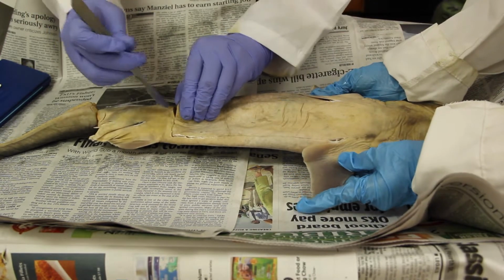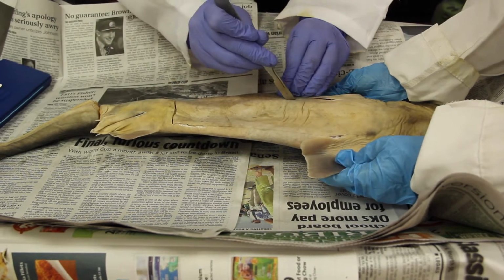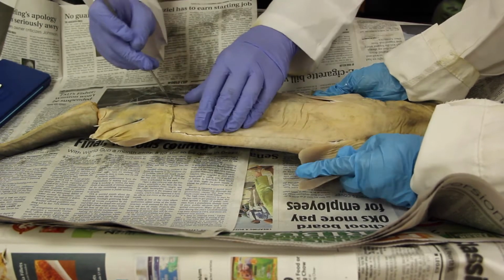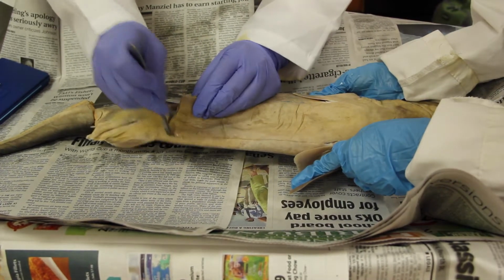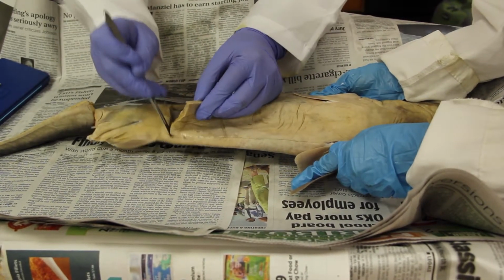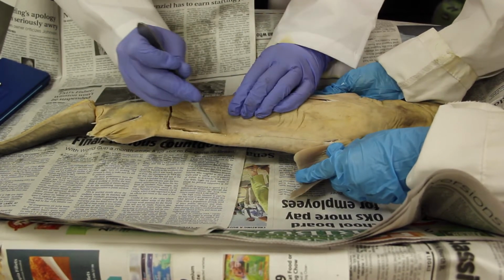Okay, let's see if we can... And if it doesn't come off right away, just redo your cuts because they might not be deep enough. The shark's skin is pretty deep.